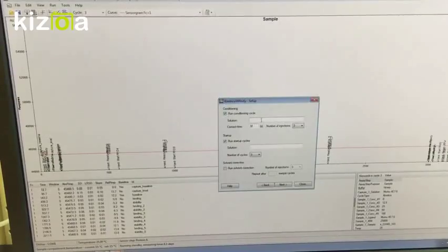So for the running condition, it is always HBS. So we'll type it in. Contact time varies. That usually is 30 seconds. If you wanted to, for example, condition your chip in a way that makes sure there's nothing binding there, you could also use glycine for this step instead of HBS. But normally I usually use HBS and it works fine.